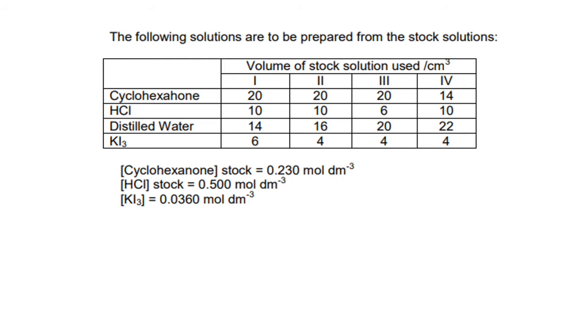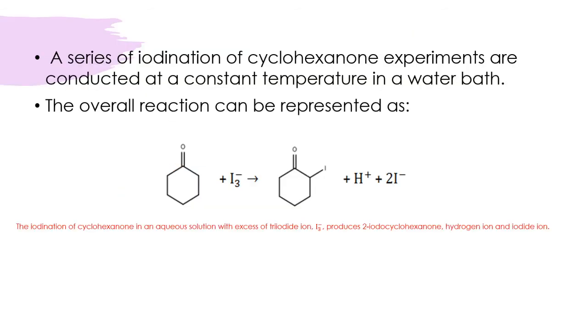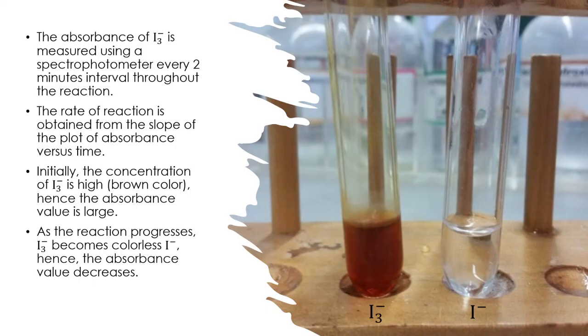Okay, and interestingly, we have HCl here. We're looking at HCl as well, although here it is part of the product that you can see. So that's something that you want to talk about when you do the discussion.